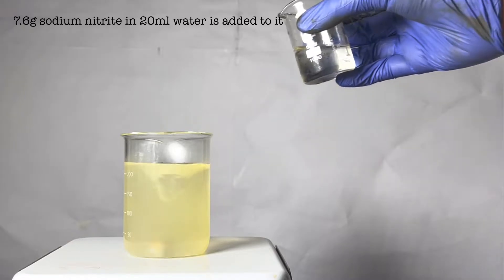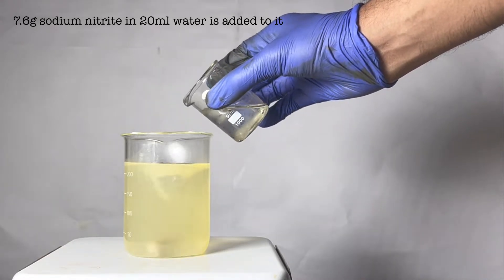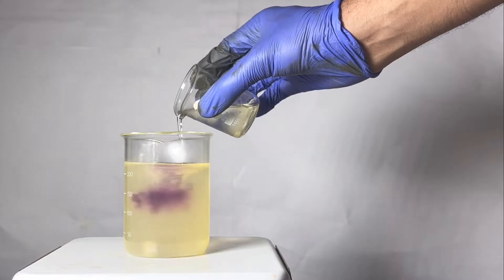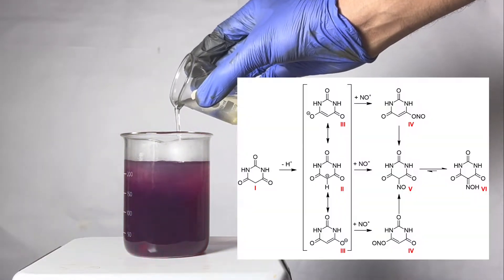Next, a solution of 7.6 grams of sodium nitrite in 20 ml of water was added to it. Immediately the whole solution turns deep purple in color. Sodium violurate synthesis is complete as per the following equation.